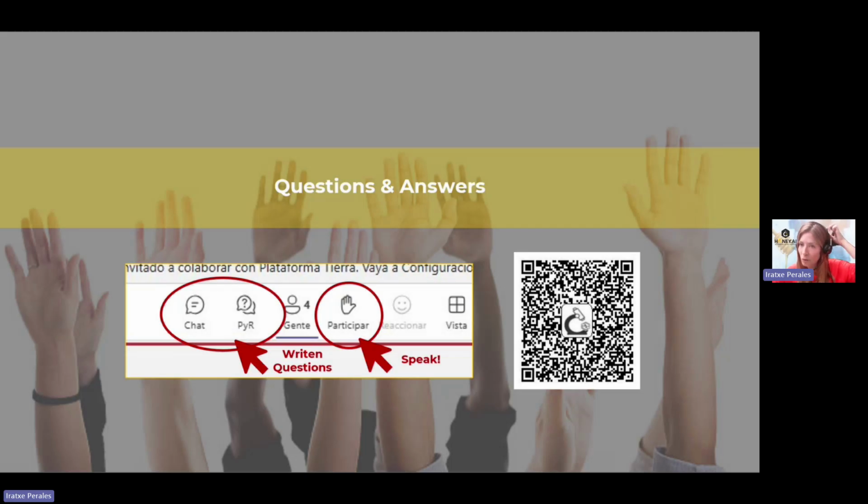Then it says, how do you provide results considering pollen types or giving information about the flora that is represented by those corresponding pollen types? I think that I already explained well how we provide results. We include nectariferous, polliniferous, and the specific composition of all of them. If you have doubts, I invite you to go to our website, go to the Technology tab, go to pollen analysis, and there we have clear explanations of the PDF of results, and which is the information that we provide.